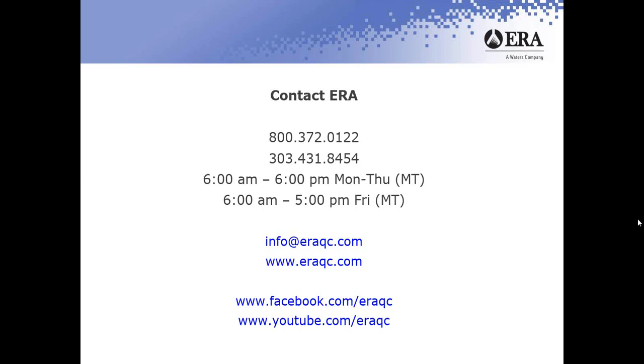It looks like there's a question from Gail. Will you ever be able to provide whole volume ready-to-use standards like other companies offer? ERA actually did manufacture whole volume samples years ago when we first started to provide PT studies. There are a lot of issues related to whole volume samples that, at least at this point, ERA has kind of been steering clear.